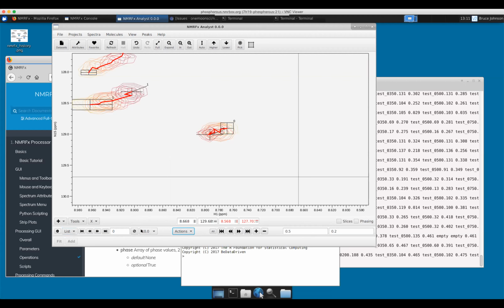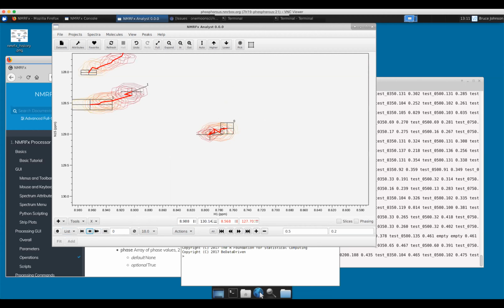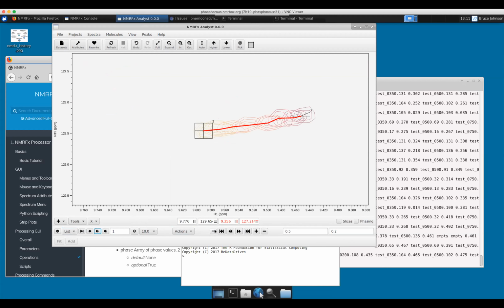This fit button is not highlighting. Zero paths.